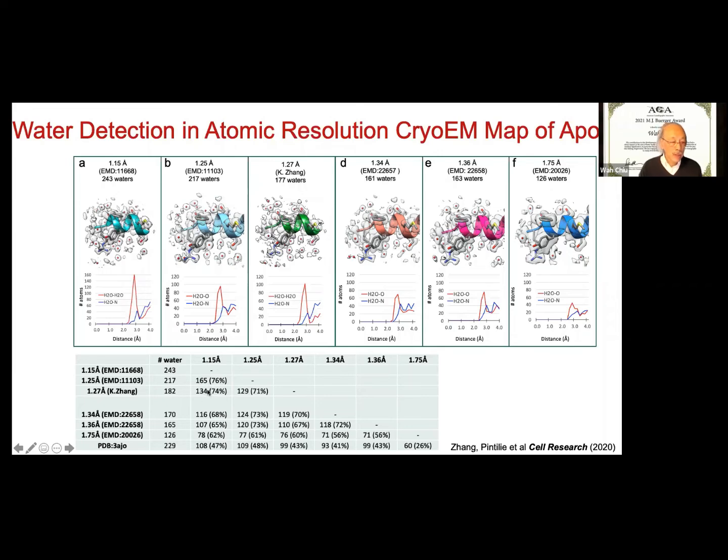And so that is exciting, because that means there are 3 independent labs that determined the same macromolecular structures. They match not only at the protein level, but at the water level at 70%, with the water position uncertainty of plus or minus 0.5 angstrom. And so I think that now testifies that cryo-EM has reached a stage where it is a very reliable method, down to the water molecule level.